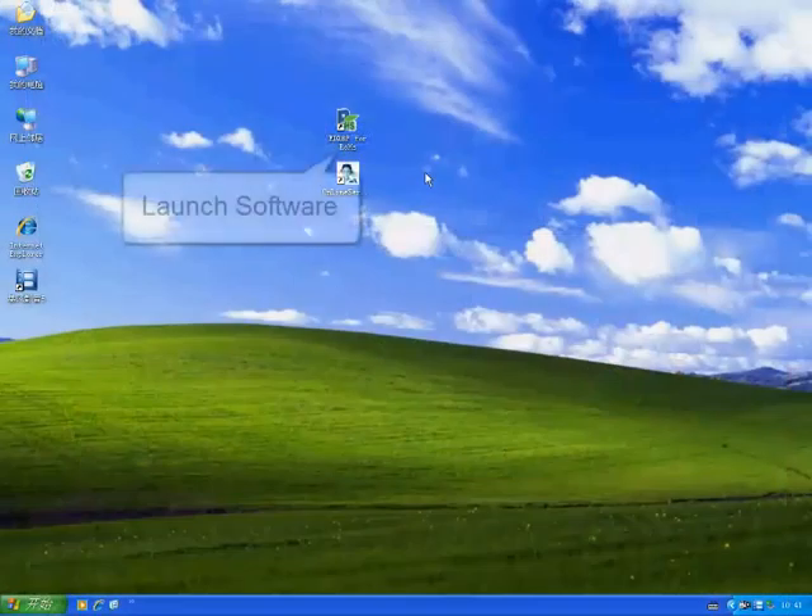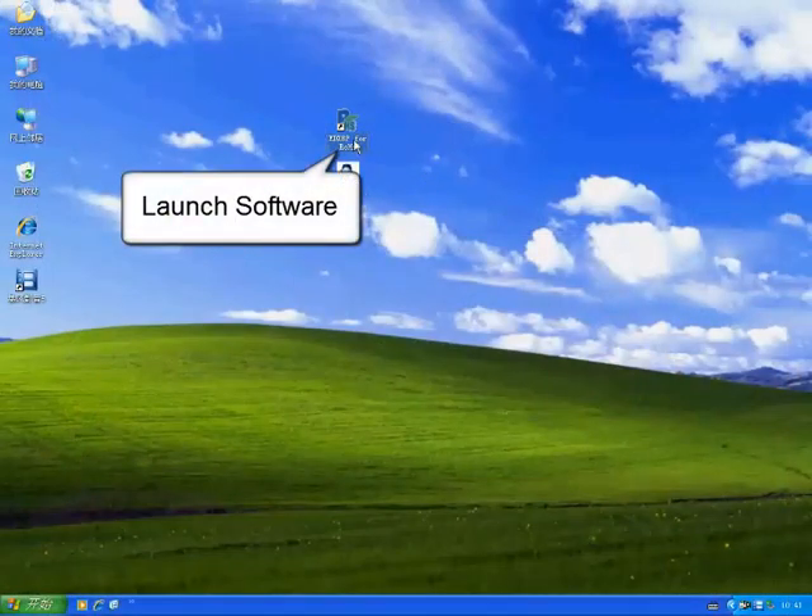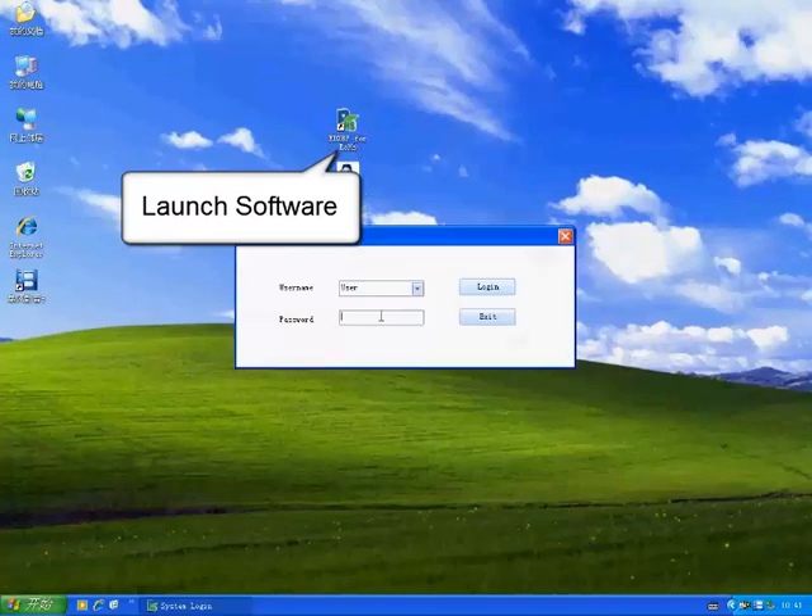Double-click the desktop icon to launch the software. Enter the user's name and password.